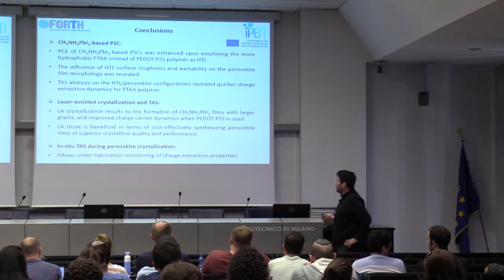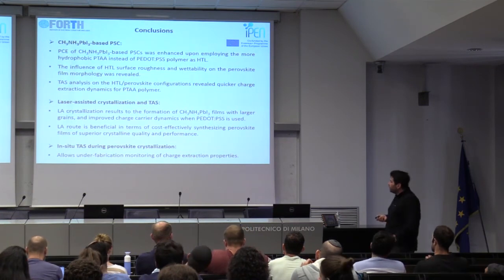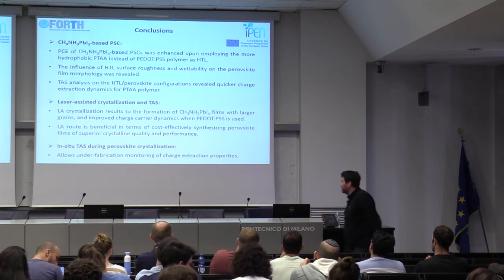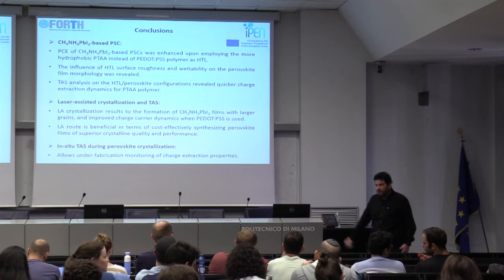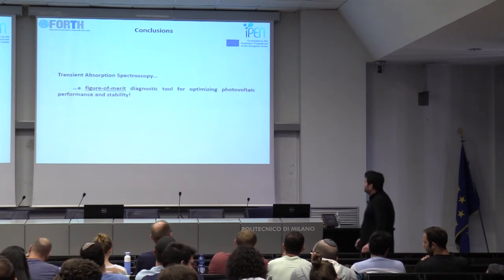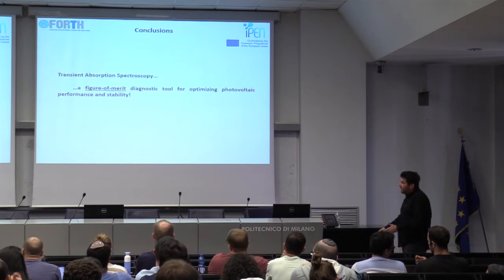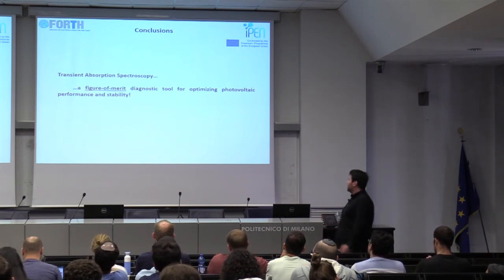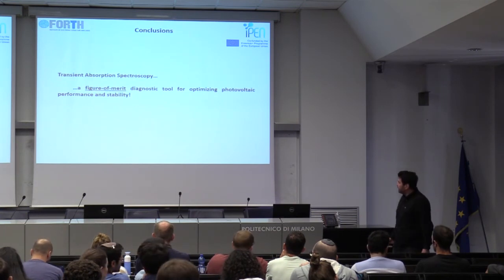And I also showed you some of the advantages of performing in situ TAS during perovskite crystallization, which allows the under-fabrication monitoring of charge extraction properties instead of doing the typical post-fabrication procedure. So I believe that these are three nice examples of why transient absorption spectroscopy is a figure of merit diagnostic tool for optimizing photovoltaic performance and, of course, stability.